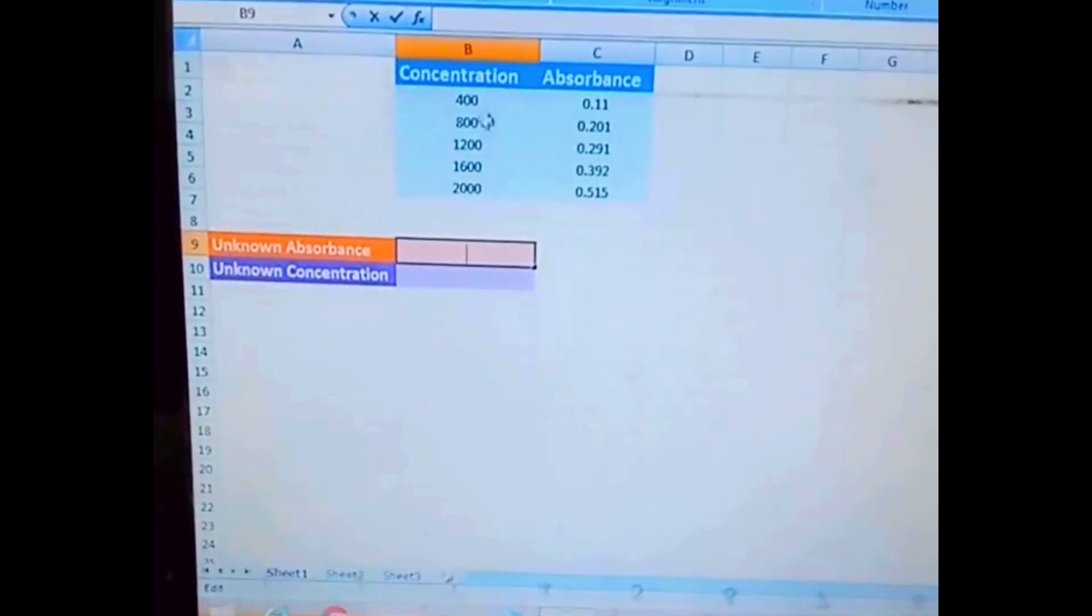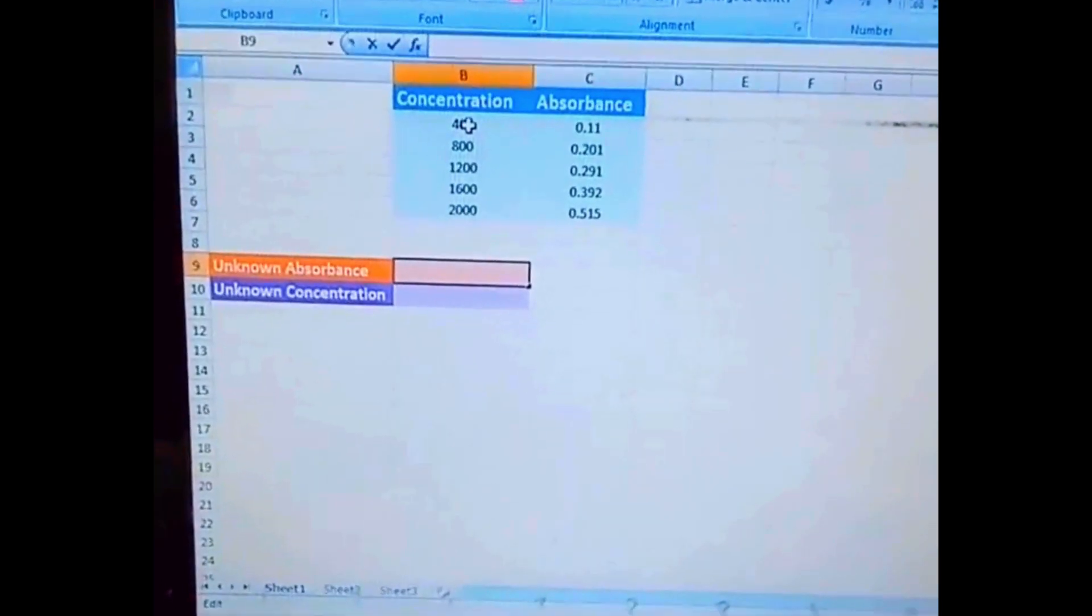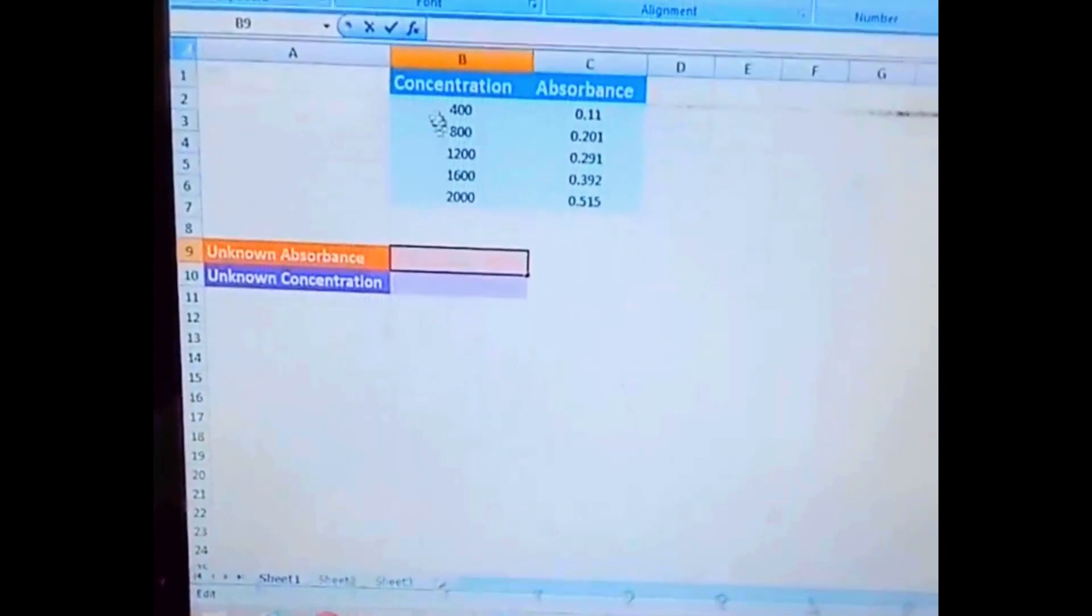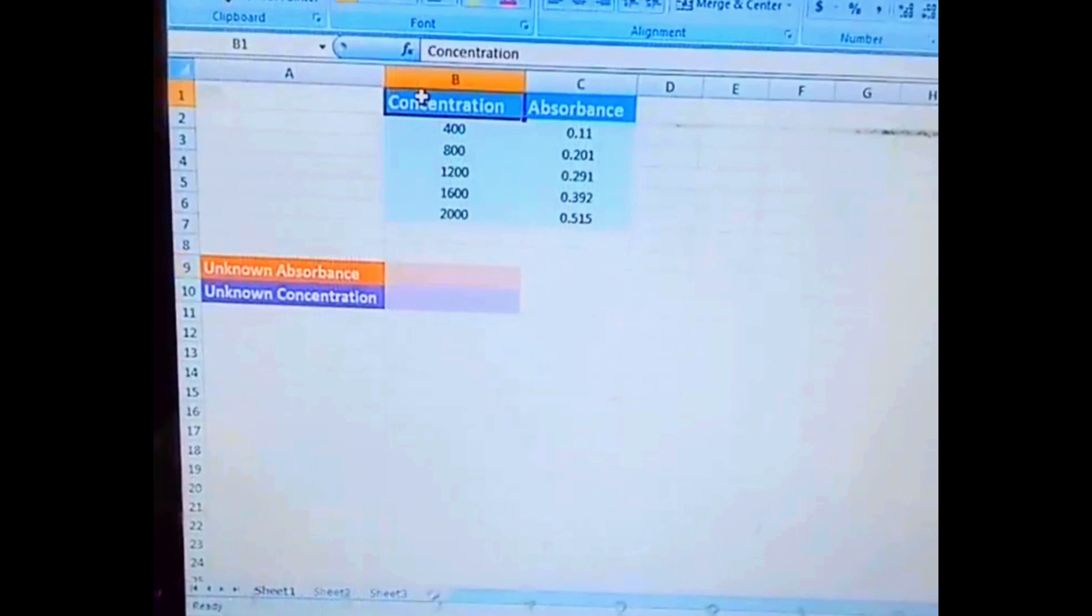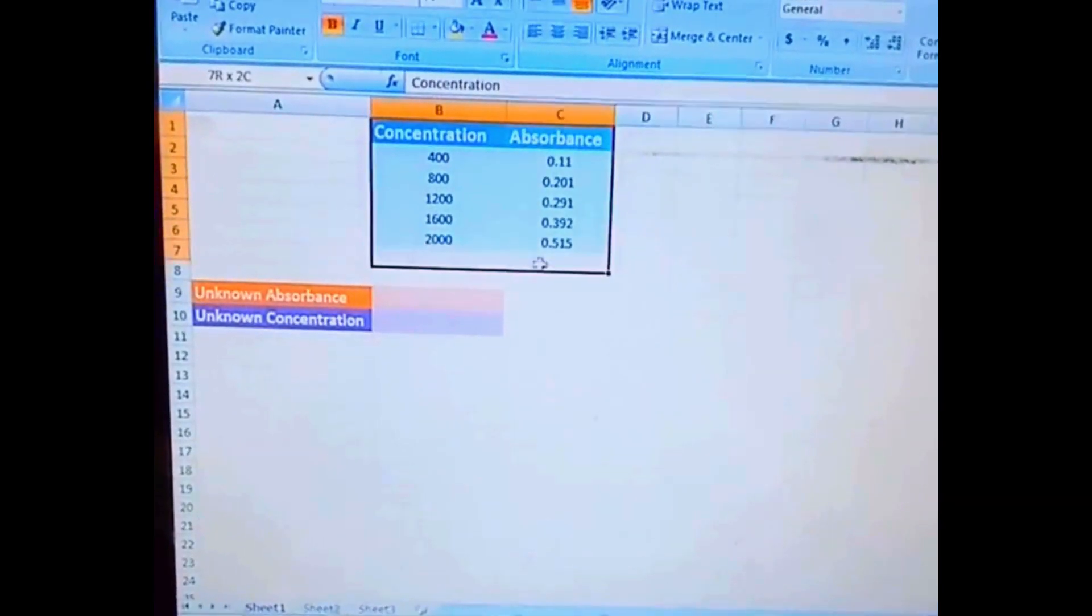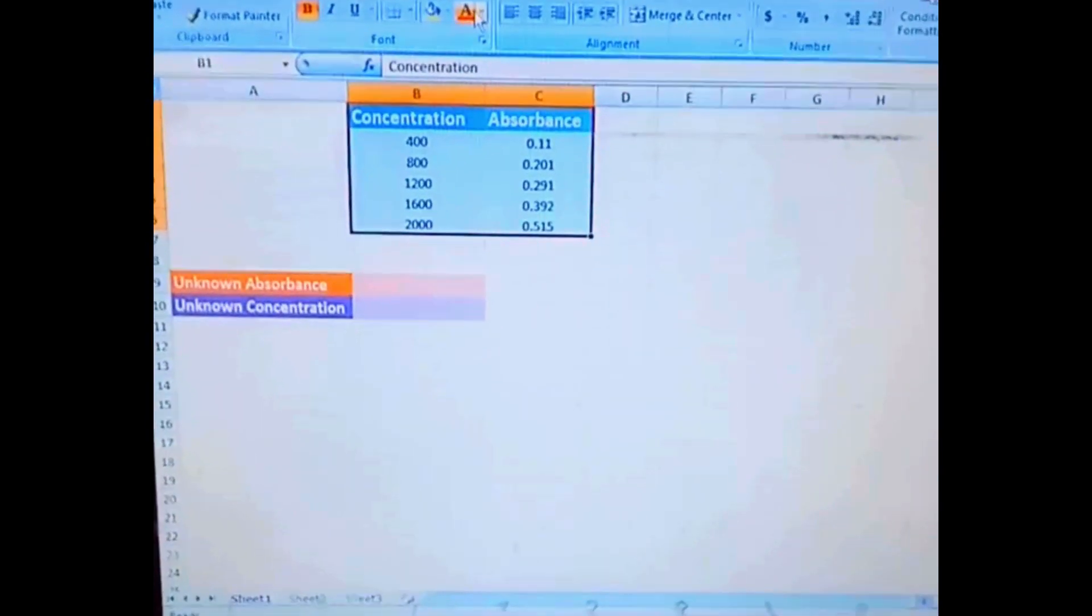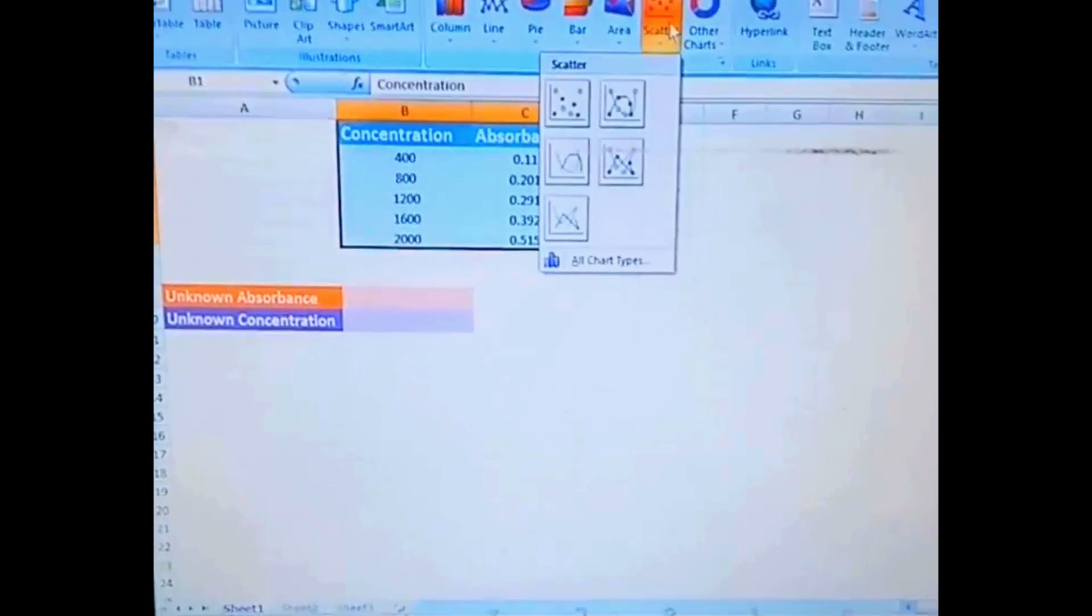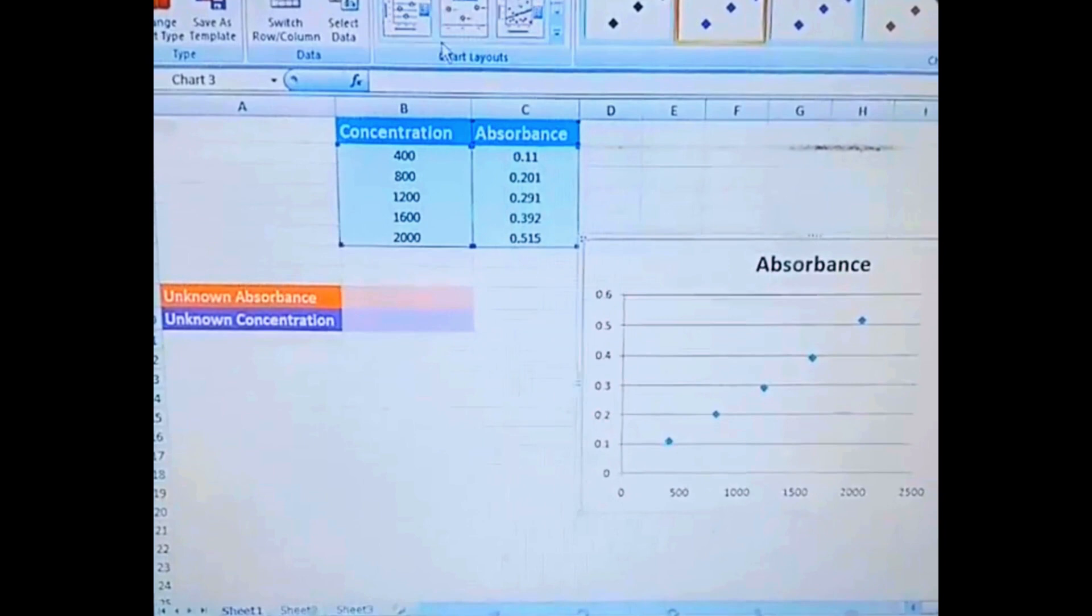Firstly, we have to create the scatter plot for the calibration curve. For that, I'm selecting our values of concentration as well as the absorbance. Now insert scatter, this first graph here, and by layout we can put according to our choice.